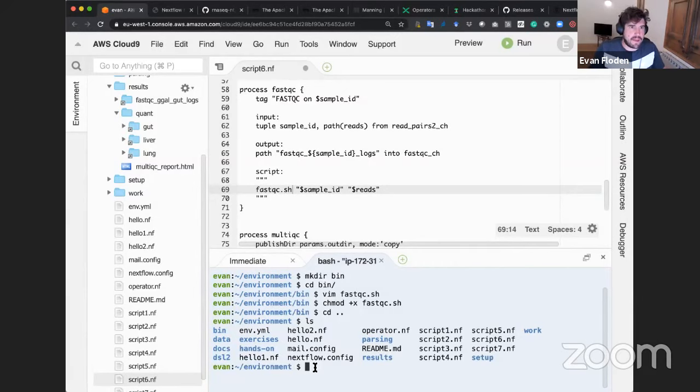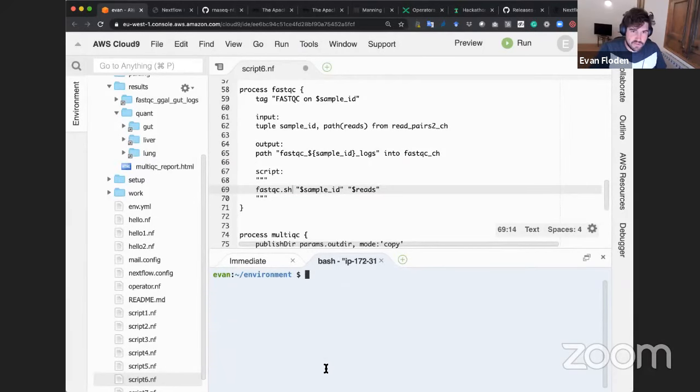What do I mean by that? Imagine that I'm going to go now execute this with AWS Batch on a virtual machine, and I'm launching this from my laptop. Nextflow will upload the script to that virtual machine, or to the S3 bucket. They're then going to be able to pull from the virtual machine and run the pipeline in that way. So you have to keep in mind these things, and that's why there are many built-in mechanisms in Nextflow which enable this portability, providing that you do it in the correct way.